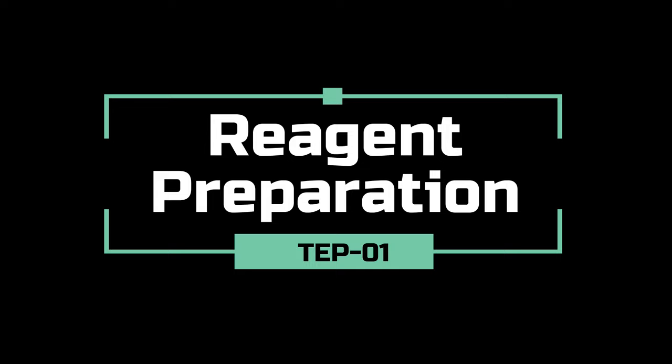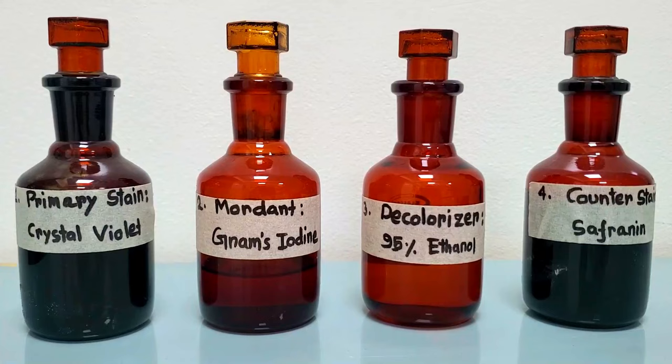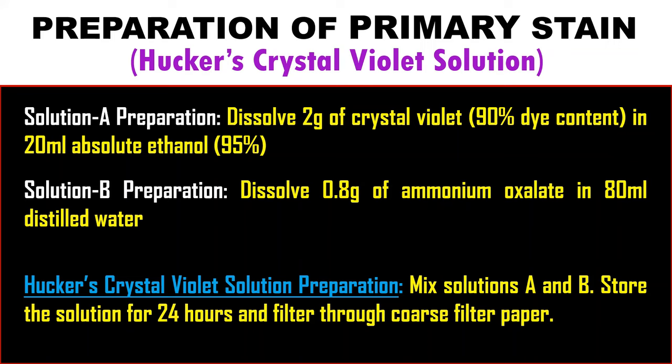Use commercially prepared Gram staining reagent set if available. Apart from this, you can also prepare all of the Gram staining reagents at your lab. Hucker's crystal violet solution is used as primary stain. For the preparation of primary stain, prepare solution A and B separately.